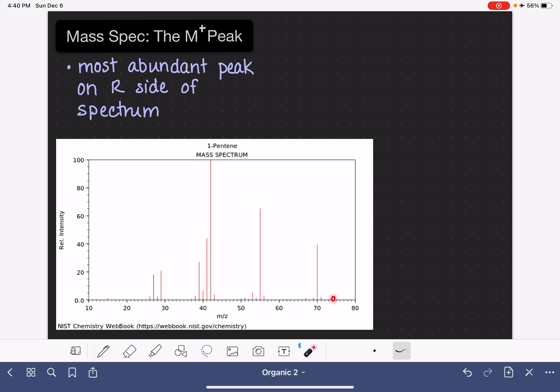We are looking for, of the peaks that are on the right hand side, which one is the most abundant. So for this particular spectrum, which is 1-pentene from the NIST database, this right here is our M plus peak.